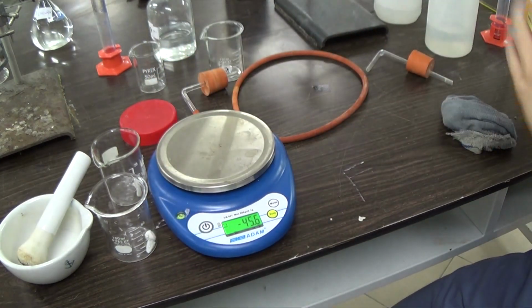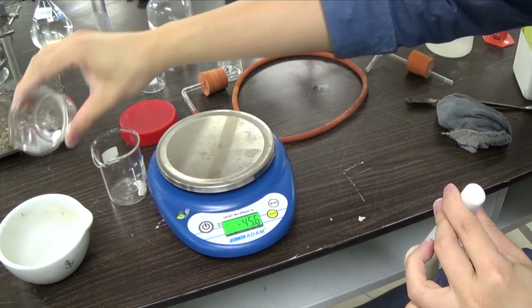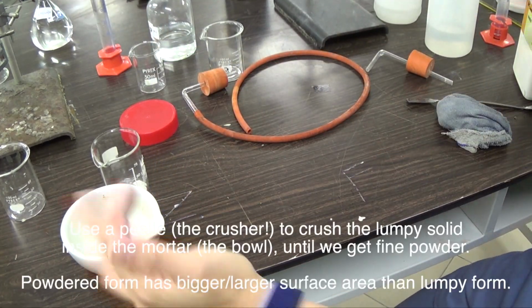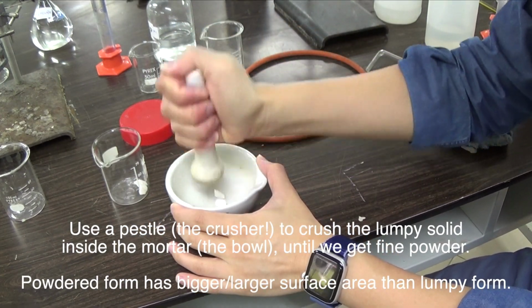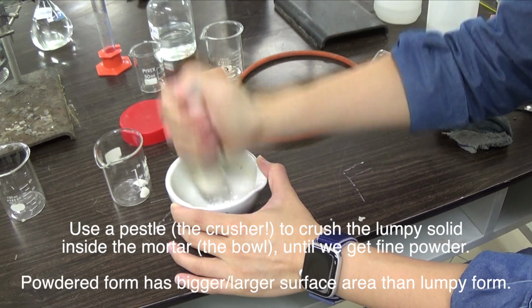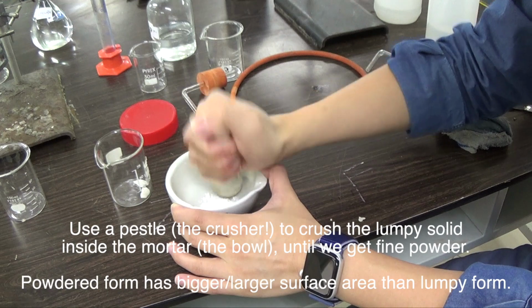So what I'm going to do is crush one of these. Both of them have the same mass, but one of them will involve me crushing the solid using a pestle and mortar. So I'm going to crush that solid.